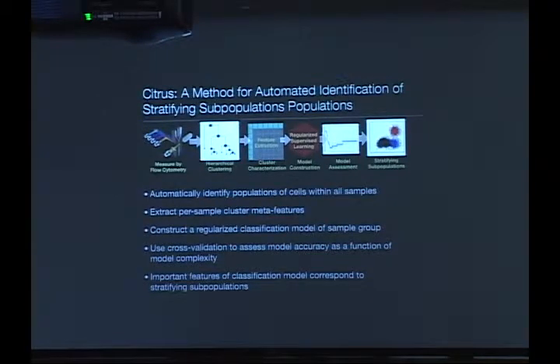So it's a slightly roundabout way of performing the same process that you would by hand, except we now have computational methods to make this more efficient, especially in circumstances where you have data measured with CyTOF and you can't really explore that data entirely by hand. So that's the general overview.